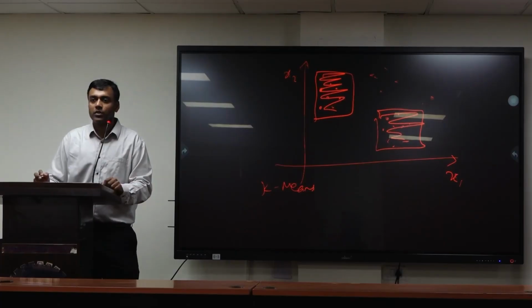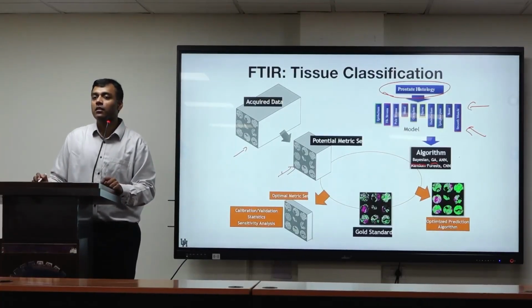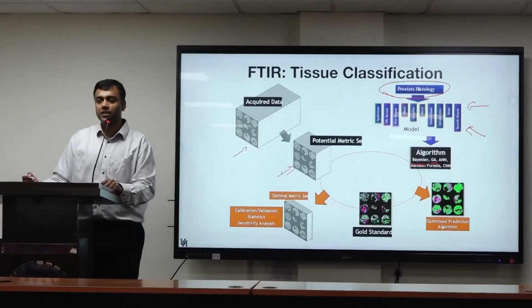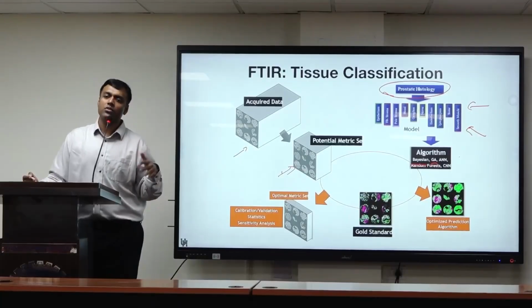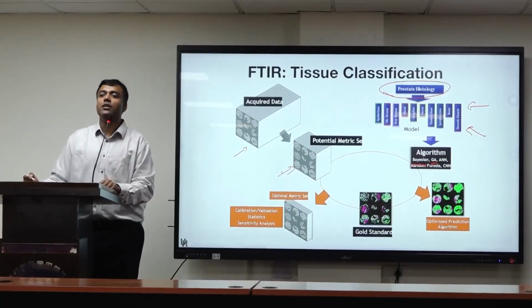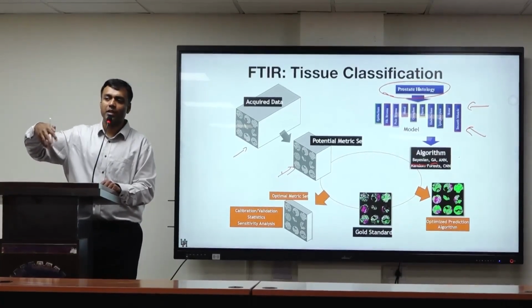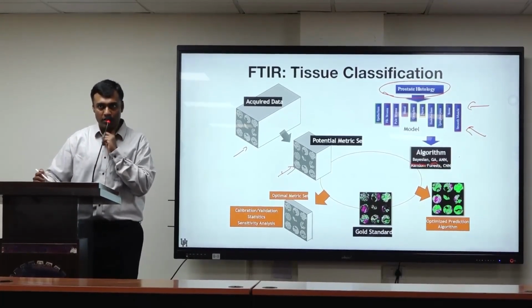Sure, what's your question? There are several different unsupervised methods. Hierarchical clustering is another one, k-means is another one. There are different ways in which you can do this analysis, and building on principal component analysis is another way of approaching this problem.